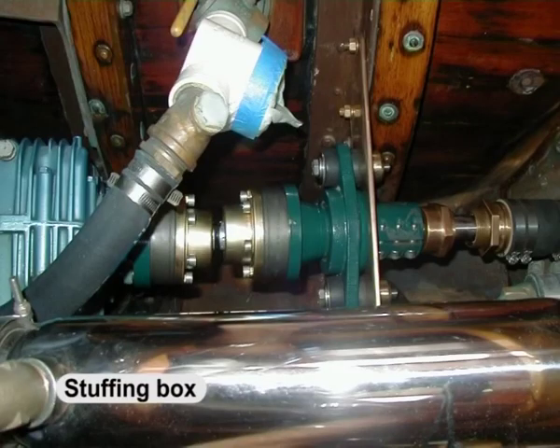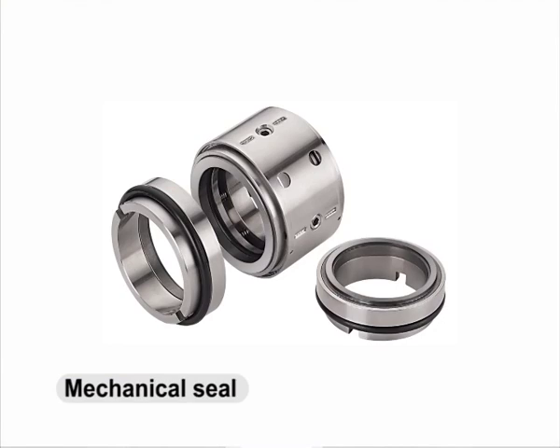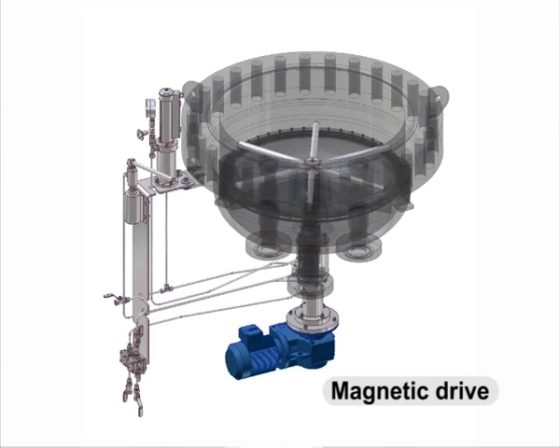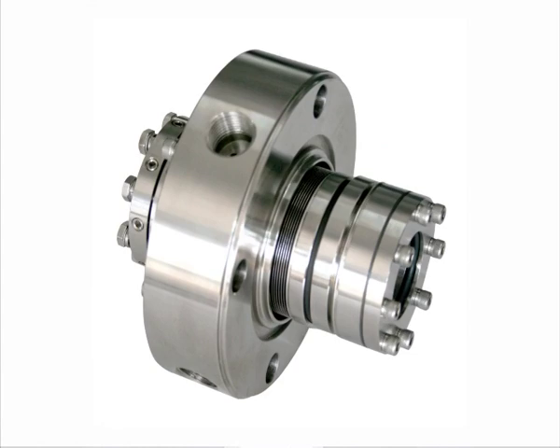4 basic types of seal assembly have been used in fermenters. The stuffing box, that is packed gland seal. The second one, the simple bush seal. The third one, the mechanical seal and the magnetic drive. Most modern fermenters use mechanical seals. These seals are more expensive, but they are more durable and less prone to leakage or contaminant entry.